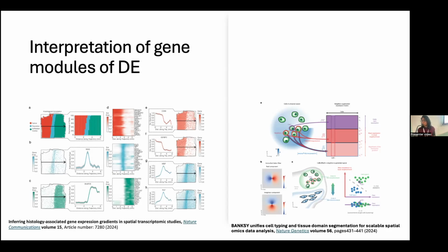I just did non-spatial. I did cell type labeling, and then I did gene expression differential analysis, and it seemed to work fine. It enriched for all the right genes. But when I applied spatial clustering and I tried to do differential analysis, all the p-values were off. It just didn't make sense. And the heat maps were all wrong. So I think the stats has to be applied properly as well.